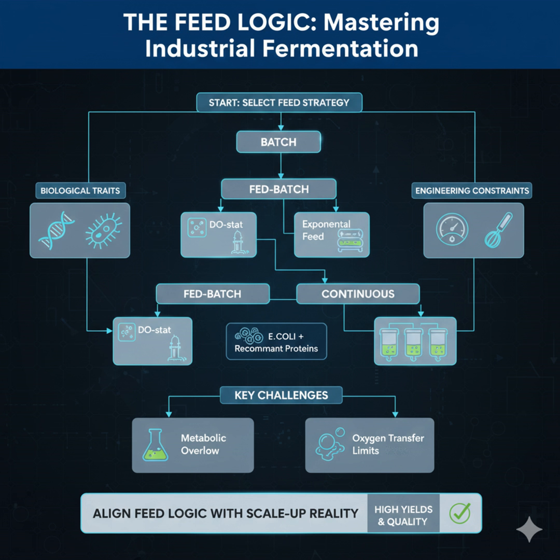That is fascinating. It's essentially letting the cells tell the pump exactly how hungry they are in real time, with the DO probe as the mediator. What about other level 2 metrics? Well, we also use pH-stat, tracking acid or base addition rate, which is a great indicator of a metabolic shift. For example, acid production from fermentation means overflow. Right. Or RQ-stat, which tracks the respiratory quotient from the off-gas. These are all elegant, simple ways to protect the batch without needing really complex modeling.